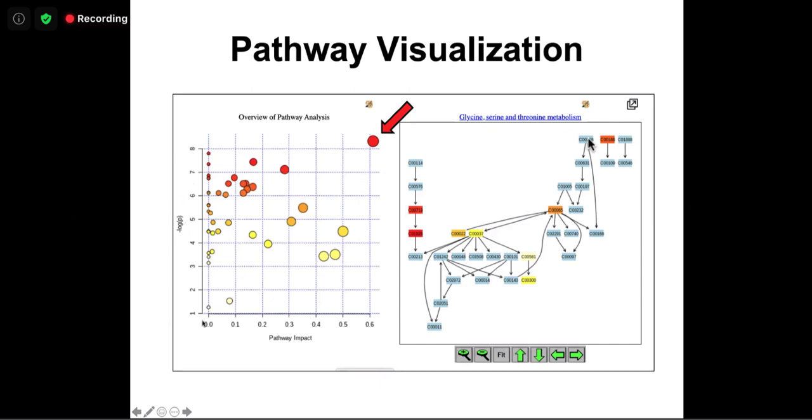So this is enrichment analysis. What we really want is pathways with metabolite changes that are significant and also in a central, important location. For example, if you click this, glycine, serine, and threonine metabolism, you will see the pathway like this. You will see that a lot of the changes are in the upstream, all in the center, because this is connected to so many other things. If you change upstream here with a lot of connections, the betweenness centrality and degree centrality are very high. Something else might give the same p-value, but only in the downstream. So if you want to see where the pathway is enriched, you need to consider impact. You need to think about the structure rather than just the p-value alone.